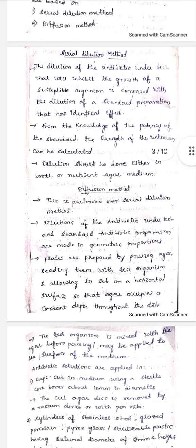First we'll see about the microbiological assay of antibiotics. For example, you can take streptomycin or penicillin. This antibiotic assay is based upon two methods. That means you have two methods of antibiotic assay: one is the serial dilution method and the other is the diffusion method. First we'll see about the serial dilution method.